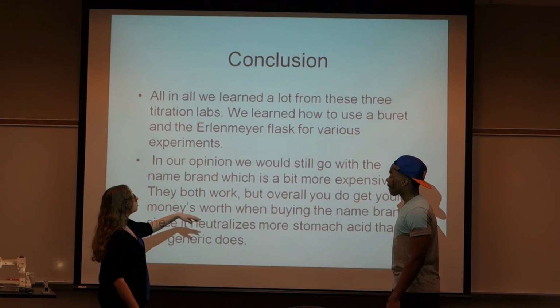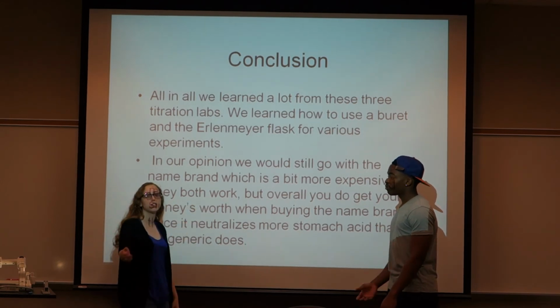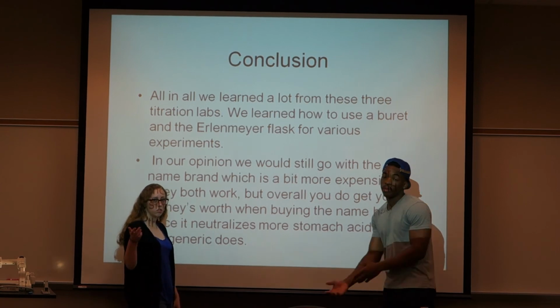Better job as well. So in these titration labs, we learned how to use the burette, we learned how to use the flasks, we also learned how to do a titration, and learned how the process works.